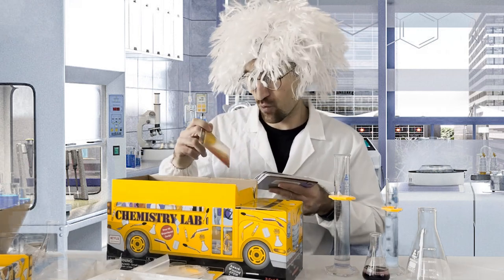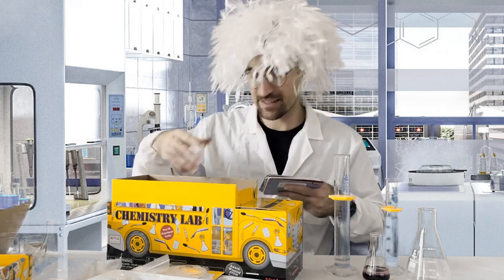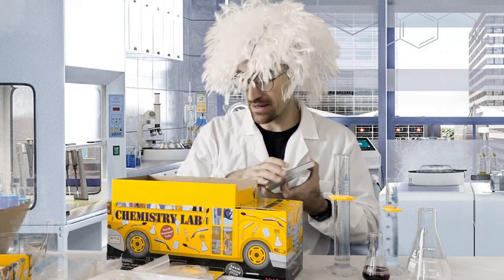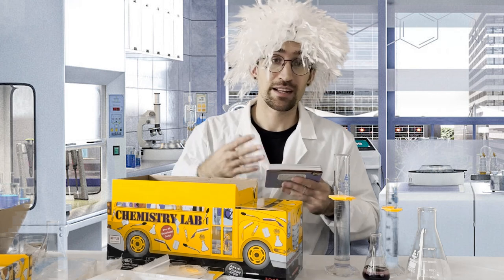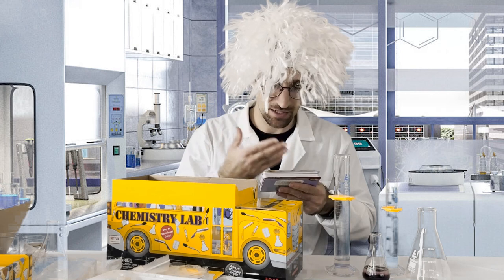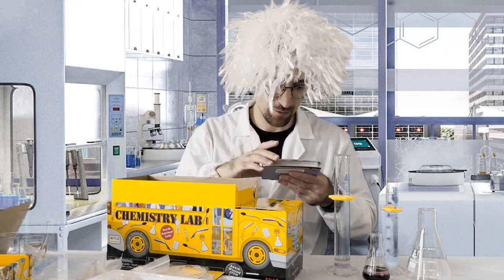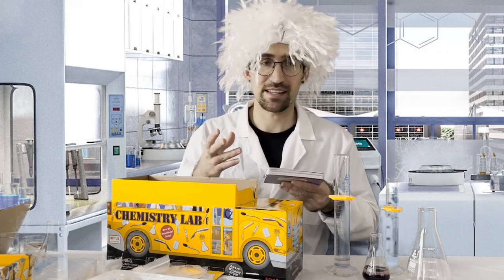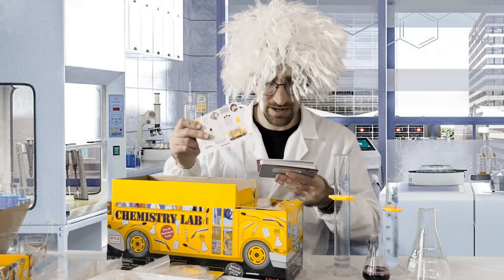As I open up the experiment cards, it's easy to see there's quite a long list of different experiments. In the Magic School Bus spirit, there's a lot of introduction around being safe, using the utilities, and what's included. As I mentioned, you'll need some household items for certain experiments — that includes black peppercorn, potentially yeast, and of course water — things that aren't fully included in the kit but you probably have at home.